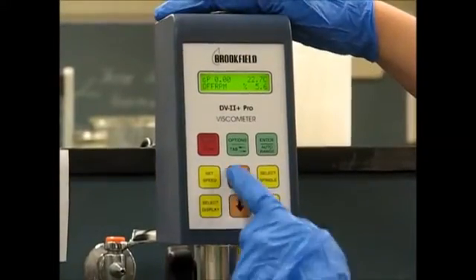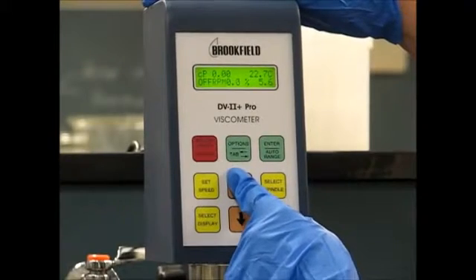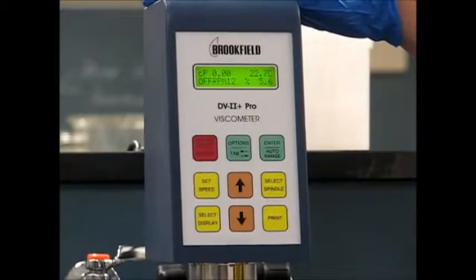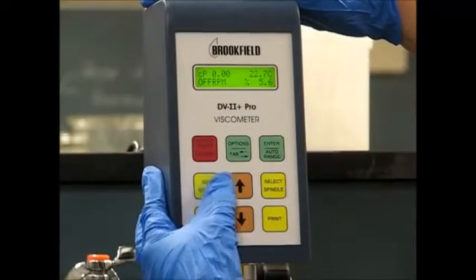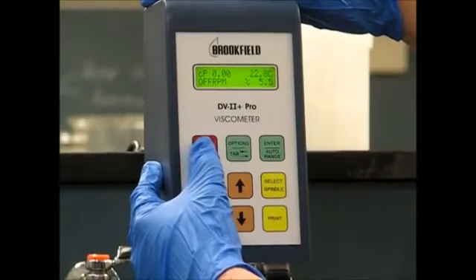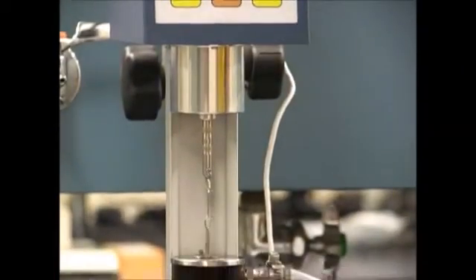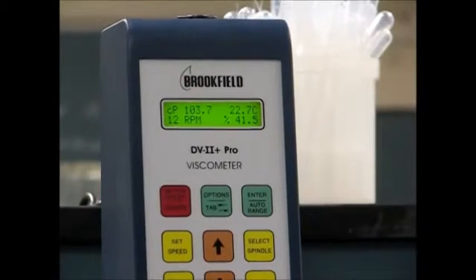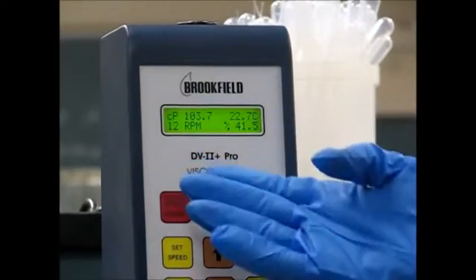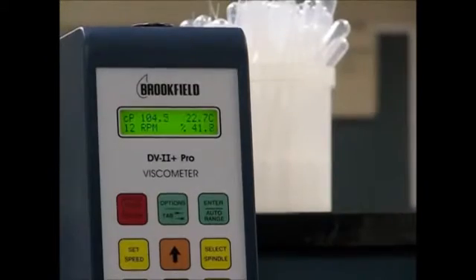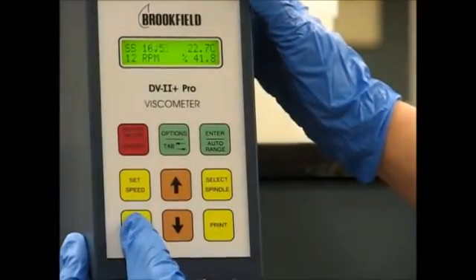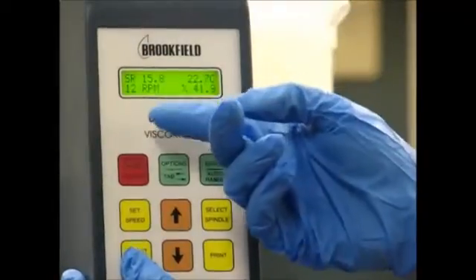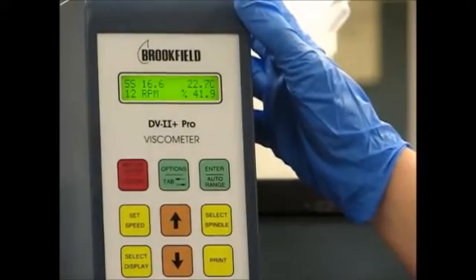Our first measurement will be taken at 12 RPMs. We set the speed and turn the motor on. Our percent torque reads 41%, which is within our acceptable range of 10% to 100%. At this RPM, the viscosity of our fluid is around 104 centipoise. We can also use the select display key to display the shear stress, and pressing it again displays the shear rate. At 12 RPMs, our shear rate is 15.8 and our shear stress is 16.6.